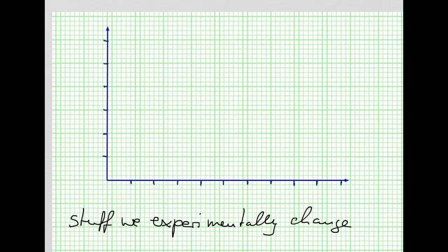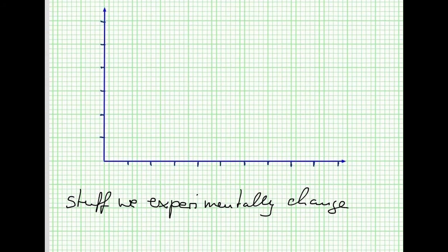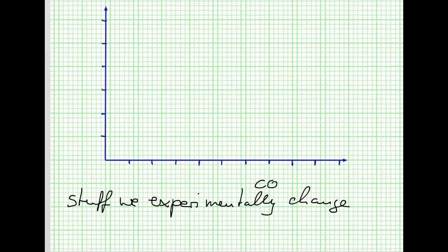So, what did we change in our experiment? We changed the concentration of our compound. So, we would say concentration of BSA, of sugar, of God knows what.